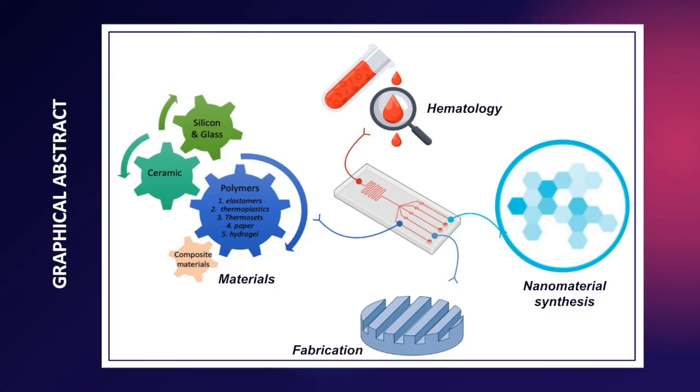To sum up our topic, we've given a brief overview about microfluidic systems, their fundamentals and physical properties, their fabrication method using photolithography and soft lithography techniques, the materials that are employed in manufacturing these small devices, and their applications in the nanomaterial synthesis and the hematology.